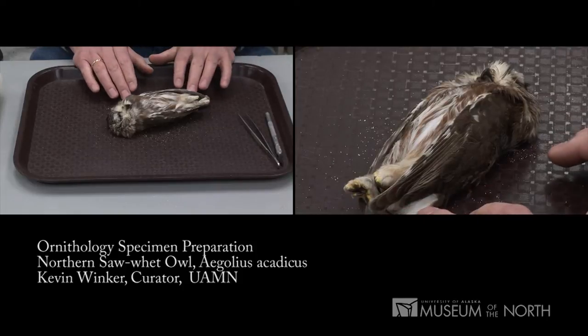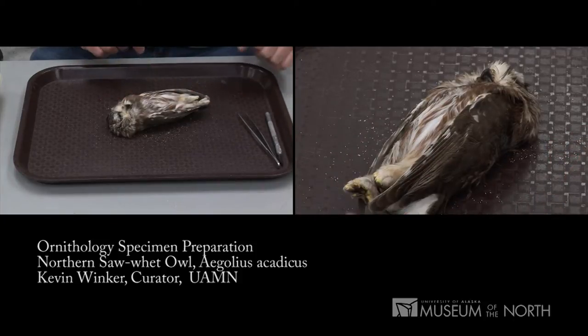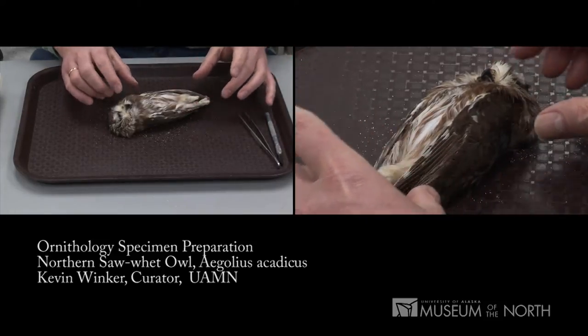We're going to skin a saw-whet owl today. Its scientific name is Aegolius acadicus. This bird was hit by a car on Kodiak Island back in March of 2006. It's been kept in the freezer since then and is well preserved.